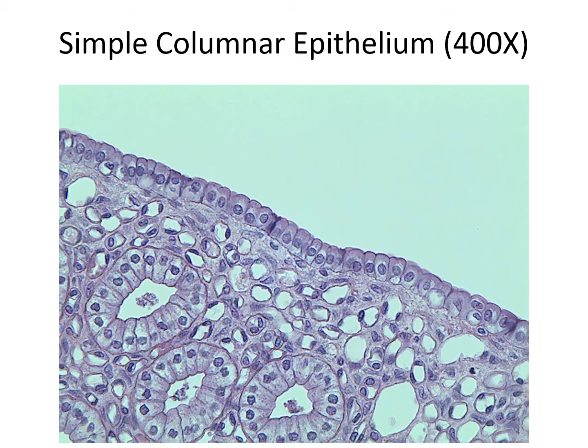Simple columnar. So that's our free surface. That's a free surface. And this line over here is a basement membrane. And here we have our columnar cells, right? And nucleus inside. And as I already said, pretty much here's a tube. So here's a bigger tube. And those are also columnar cells. Right. Okay, so simple columnar.